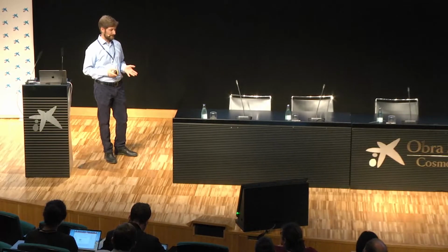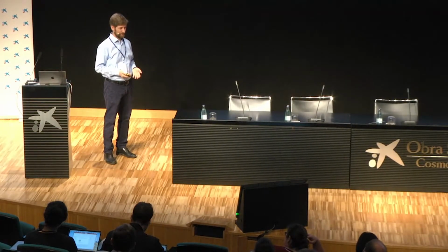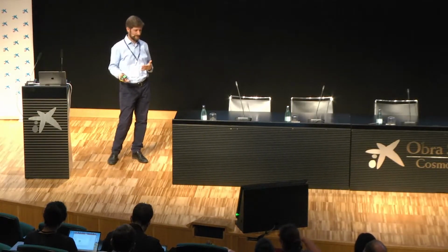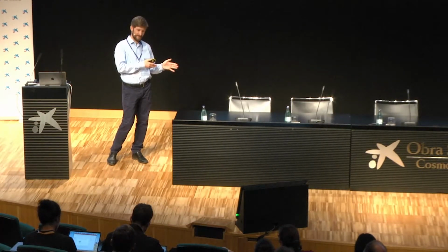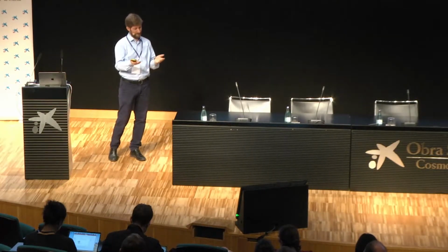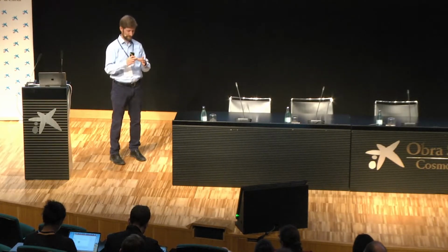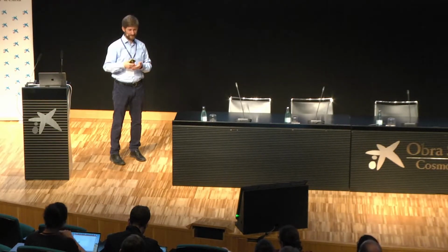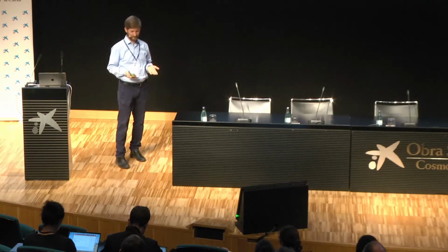So I believe that many of the technologies I showed you before are ready to address important biological questions. And each of these technologies has different strengths and weaknesses, and then it really is a function of the question that you want to address. If you're interested in subcellular distribution of proteins, then you should go for a technology that gives a really high resolution. If, like what I've shown you, we just look at a cellular level, and in any case integrate across a cell, then very high subcellular resolution is not really relevant. So it's really driven by the question.